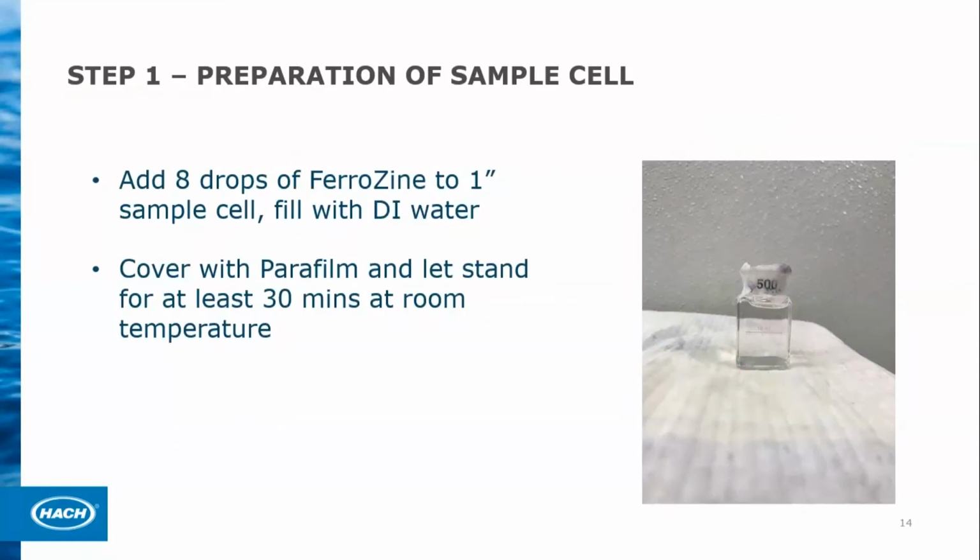So now, again, we're talking about a grab sample method, and I'm going to talk about the preparation of the sample cell. What I'm saying here might be a little bit different than what I said about doing a grab sample, but in a lot of ways it's similar, and it's so important to do this properly, because if not, you're not going to get a good analysis.